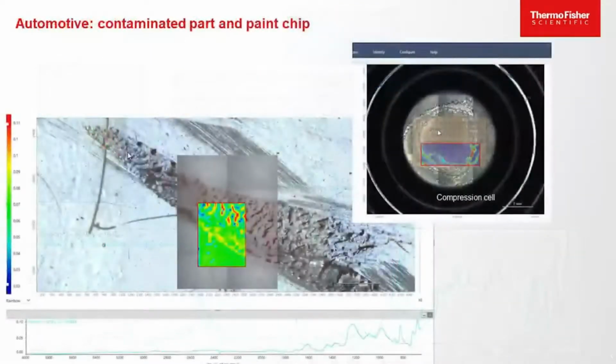Now, these are images from the automotive industry looking at a part that was contaminated. That's what you see in the upper right, in a compression cell where the sample's been flattened, and then a spectrum at the bottom of a material, in this case laying on a gold slide, so it's a reflection absorption experiment. And you can see the different colors of material. Now, can't talk too much about what it is because this one's still proprietary, but you can see the quality of the spectrum again and the type of thing that you can do with the two methods.